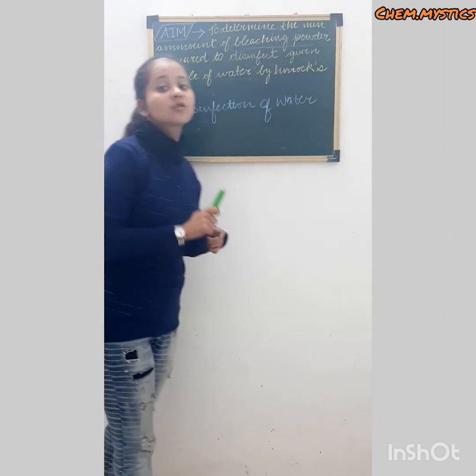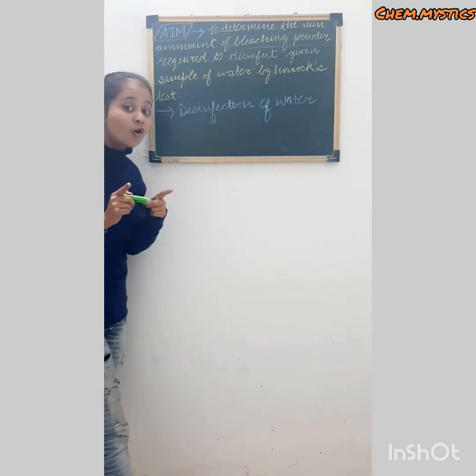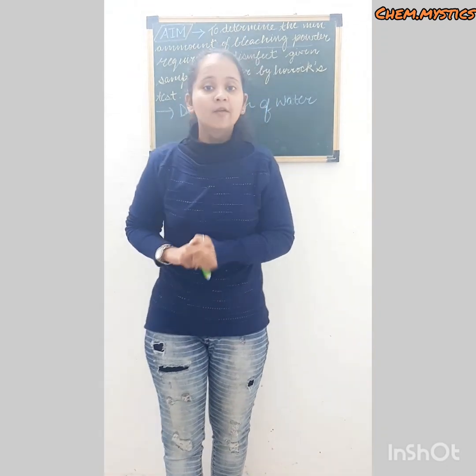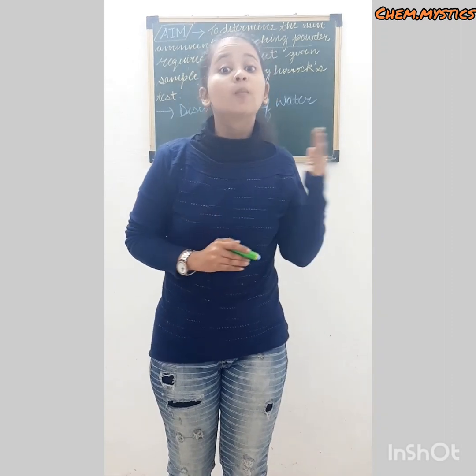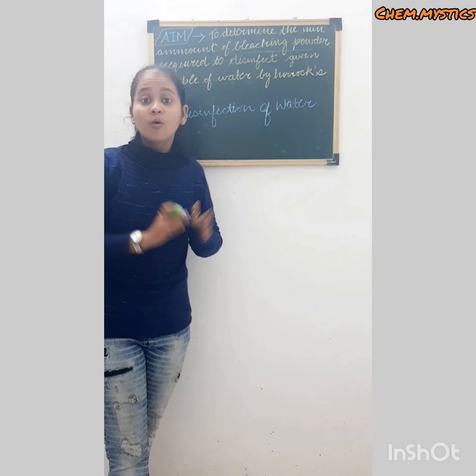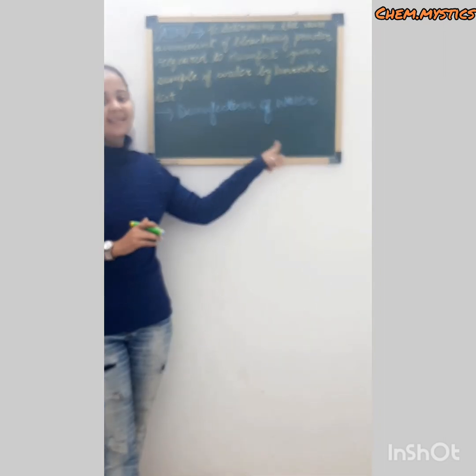To utilize this water in our daily life, we would like our water to be pure and safe. Yes or no? Yes. We would like our water to be free from all the pathogenic microorganisms, from sand, from clay and from all the organic impurities. So, to make water safer to use, disinfection of water is done.